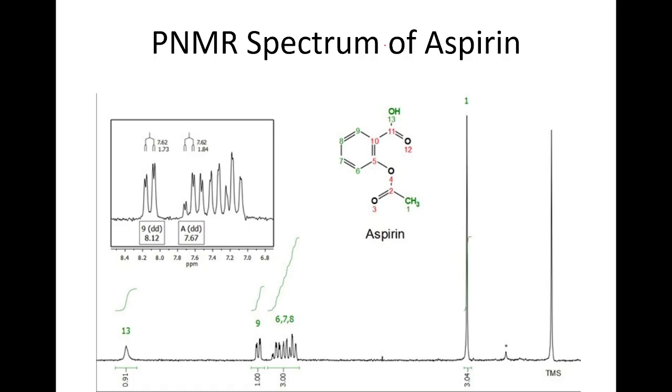Now, this is the structure of aspirin. I'm not going to draw anything unnecessary, but we're going to number everything on the structure, not just carbons. We start from here, 1, and that's another carbon, 2, oxygen 3, another oxygen 4, that carbon here 5, there's a carbon there 6, carbon 7, carbon 8, carbon 9, carbon 10. Then we go to another carbon which is 11, then that oxygen is 12, and that oxygen is 13.